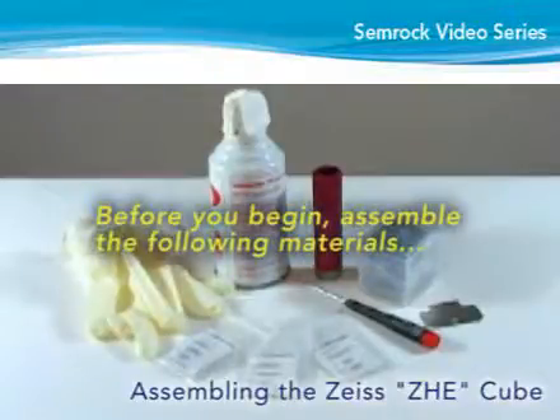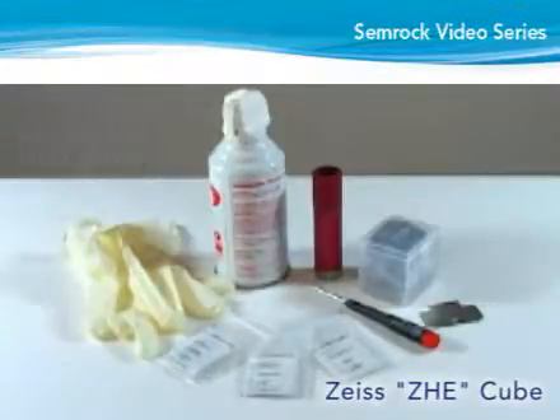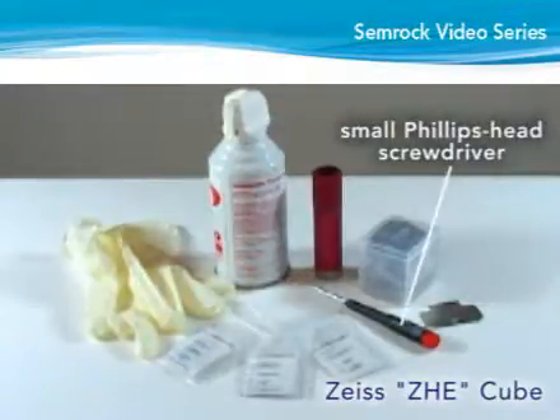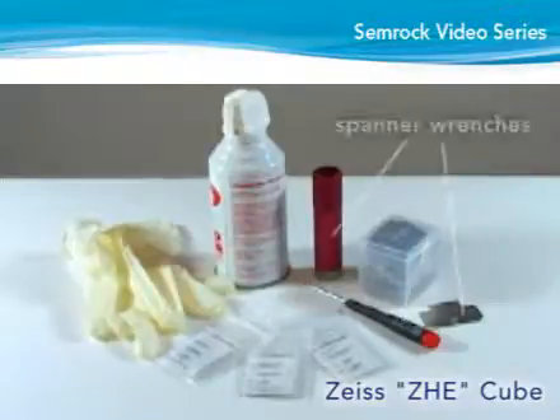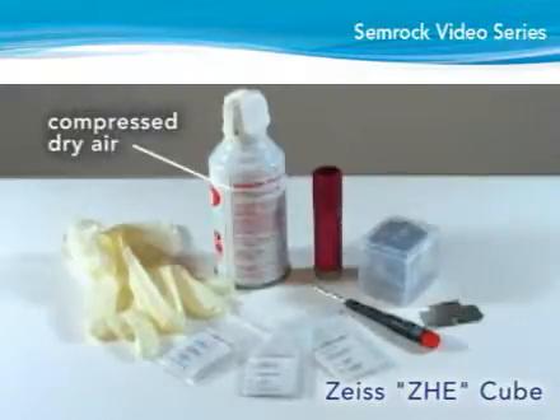Before you begin, assemble the following materials: powder-free latex gloves, a Phillips head screwdriver, a spanner wrench for screwing a retaining ring for 25mm diameter optics such as the Thorlabs SPW602 spanner wrench, and a bottle of dry compressed air.